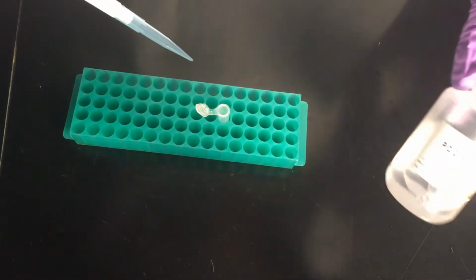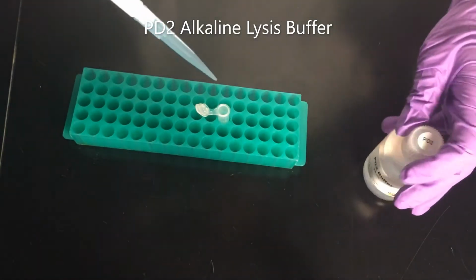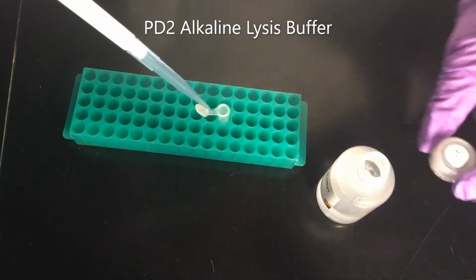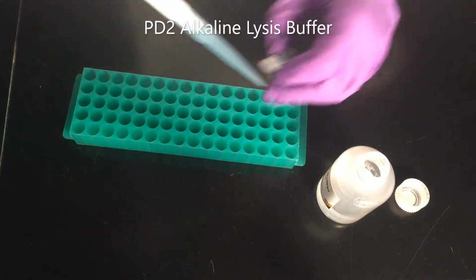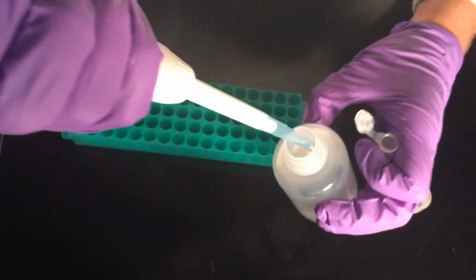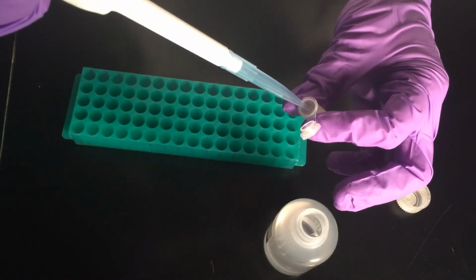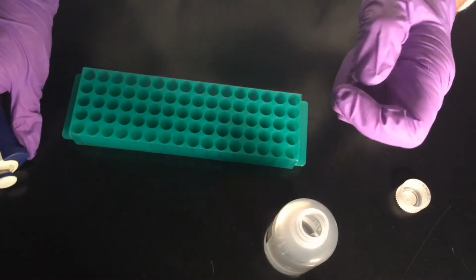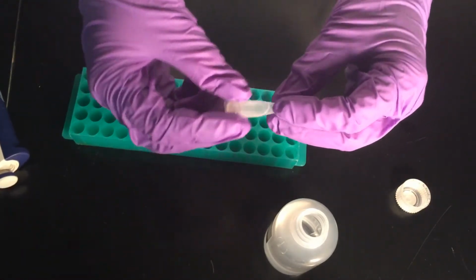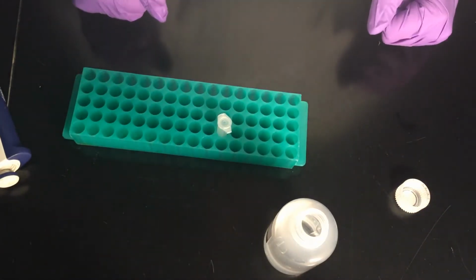In the next step, I'm going to add 200 microliters of PD2 buffer. So PD2 buffer contains a couple of ingredients. The first ingredient it has is a detergent called SDS. SDS stands for sodium dodecyl sulfate. What the sodium dodecyl sulfate does is it's a very strong detergent, and what it will do is actually dissolve the membranes of the bacterial cells. So it's going to dissolve those membranes, and it's going to lyse the cells.